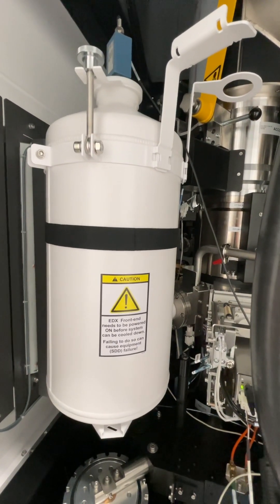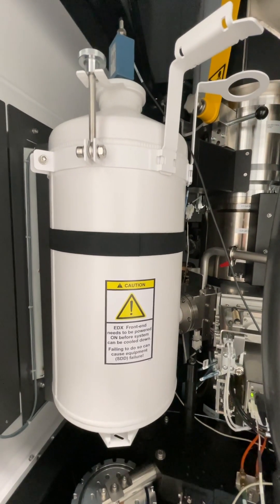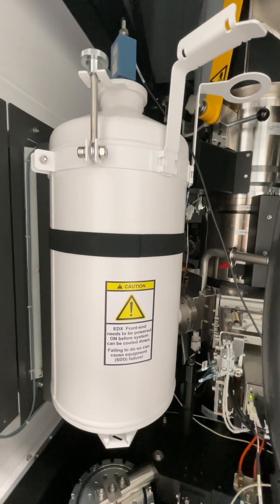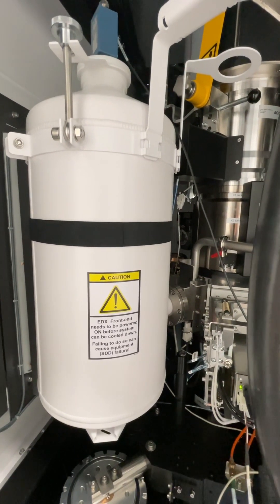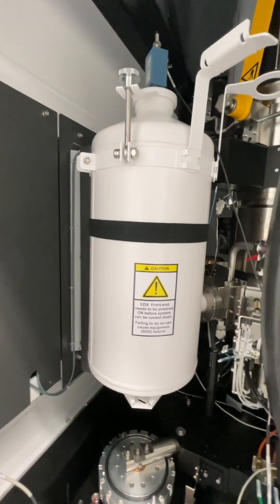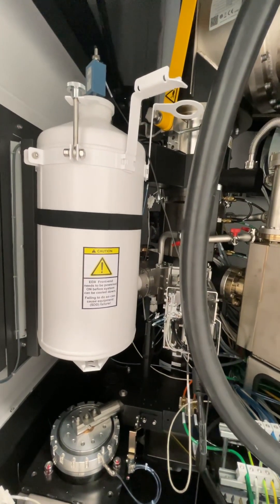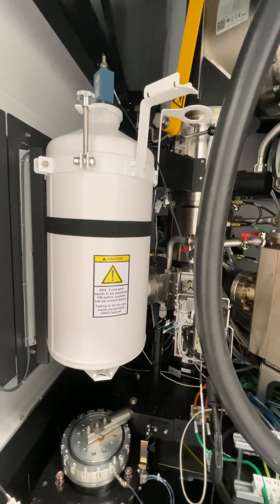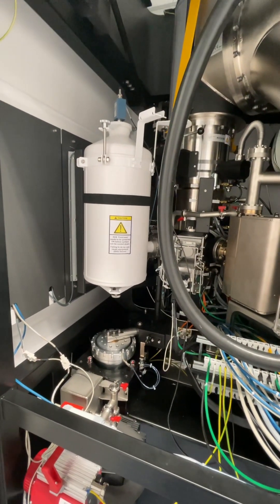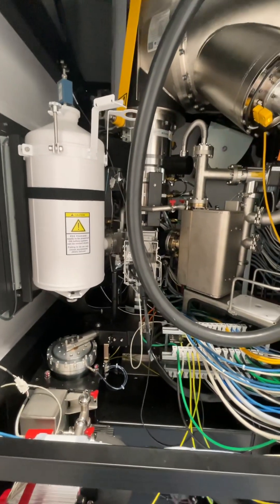We're not going to have users touching the liquid nitrogen, which is good for safety — people can get cryo burns. It's a good practice for students continuing in electron microscopy, but hopefully they'll get that experience in other labs. This setup will be good for general users who just want higher resolution imaging and EDS data from their geologic samples.